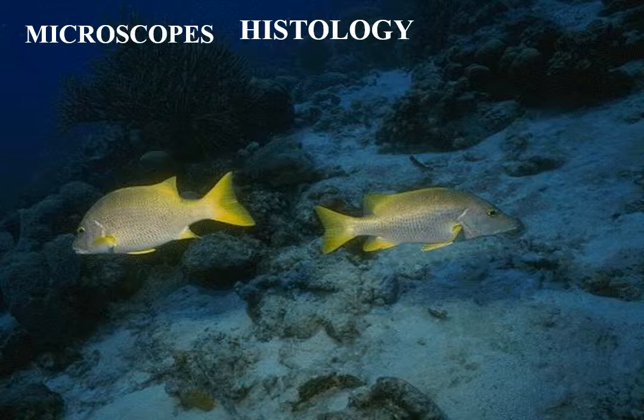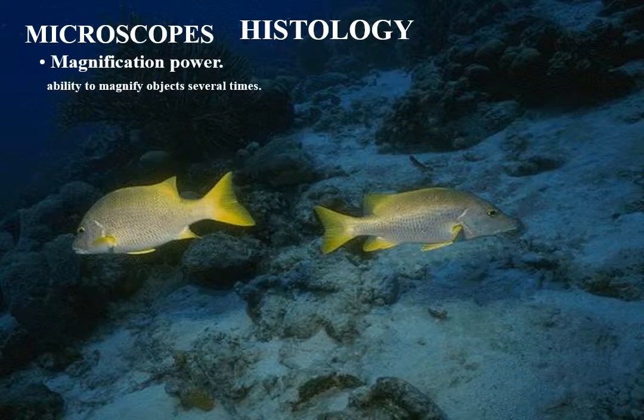Classification of the different types of microscopes depends on their magnification and resolution power. Magnification power is the ability of the microscope to magnify objects several times. Resolution power, on the other hand, is the capacity of the microscope to see two particles close together as separate objects.